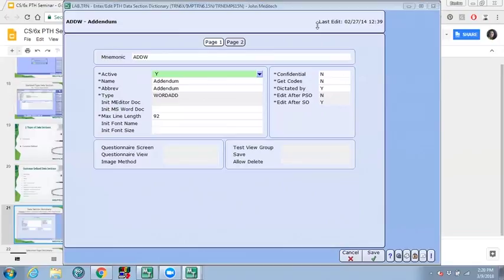So we do have a question from Kim Brothers, which is asking, can you bold the diagnosis? Are you requesting to bold a data section, or just the header of that data section, or the entire data section that might be called diagnosis? Most of the time, whether or not a piece of information will be bolded depends on the report that you're using.